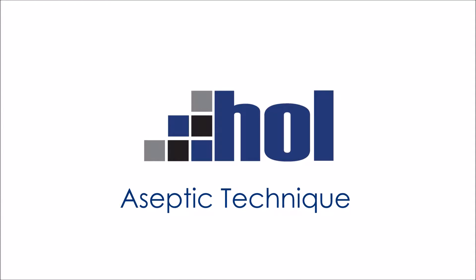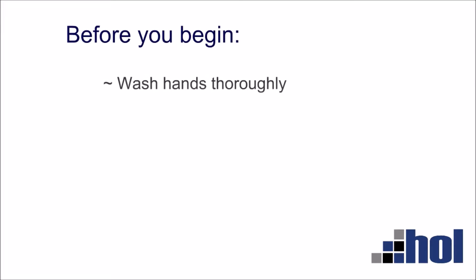Aseptic Technique. Before you begin, wash hands thoroughly and dry with paper towels.